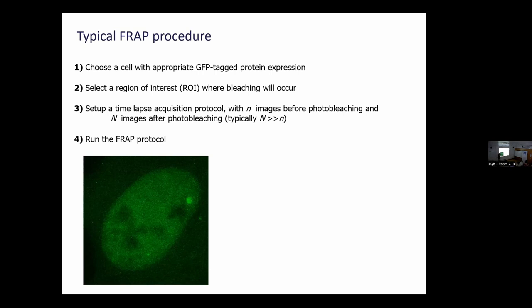And so here we have RNAs being transcribed that are bound by this GFP molecule. Let's see how long it takes for these RNAs to be turned over, to be released, and new ones will be transcribed. So we did the FRAP experiment, there you go. And this is in real time. I don't have a time slide, but you can see that it recovers very, very fast.